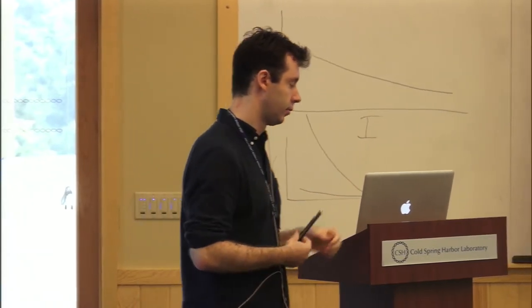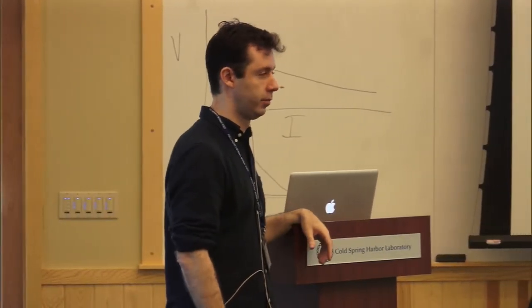I'm only interested in differential expression for an RNA-seq experiment. Is there any good reason to do paired-end there? No. That's the bottom line.